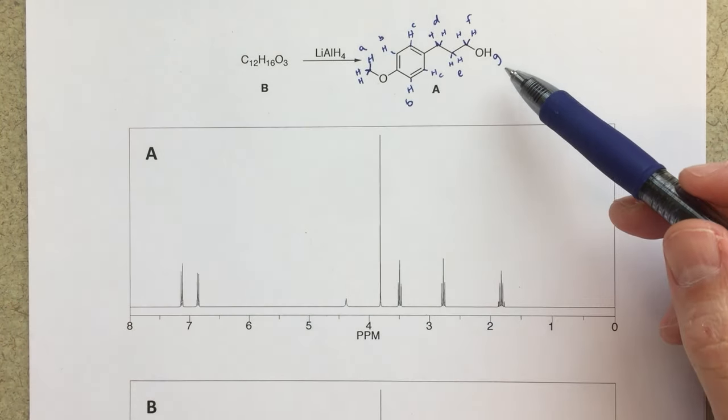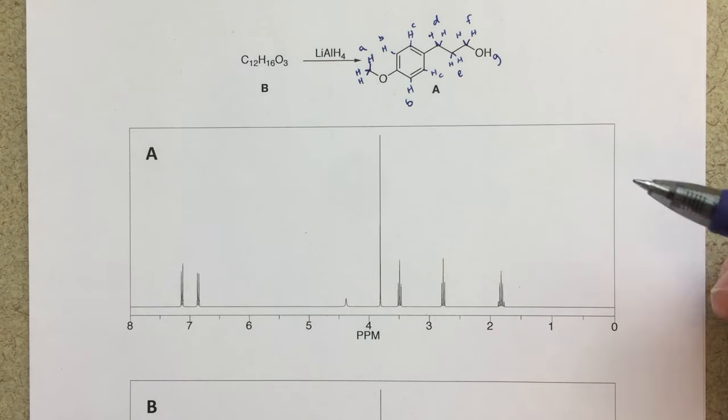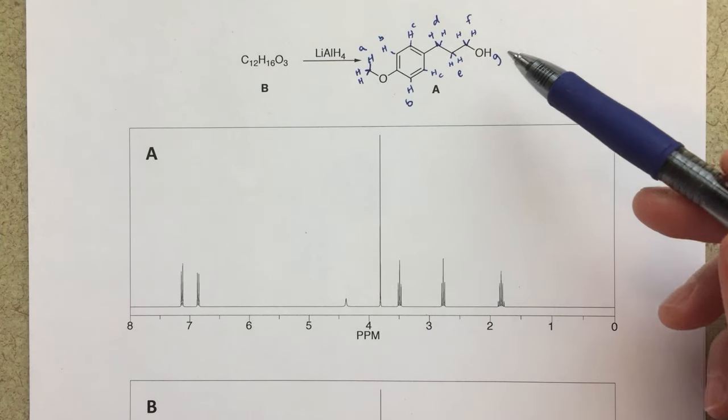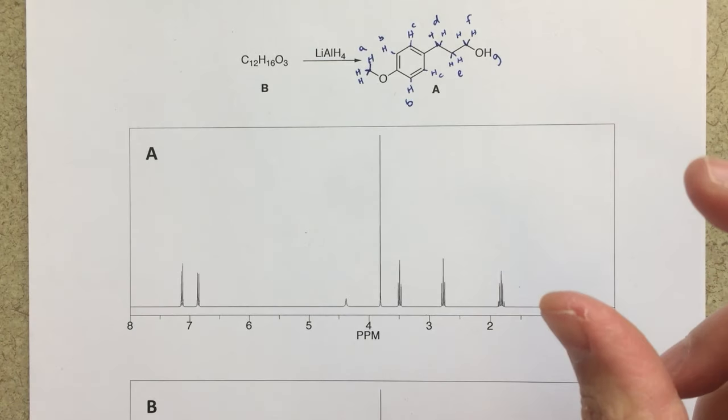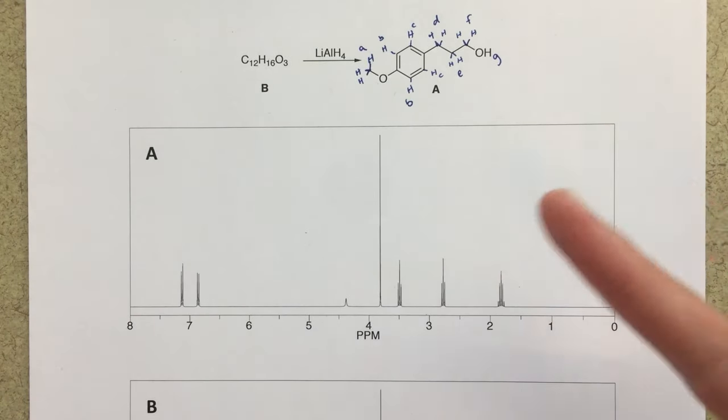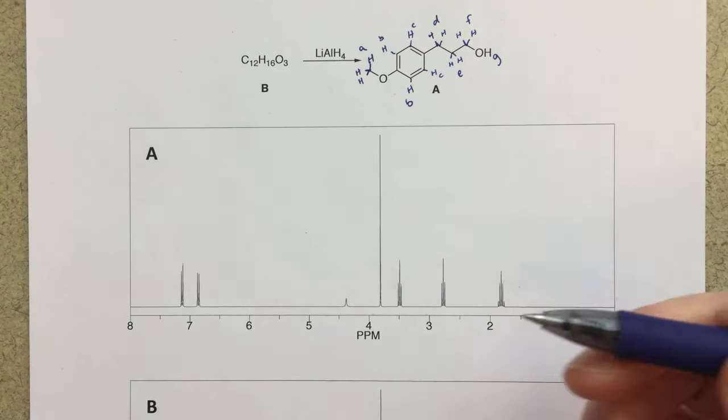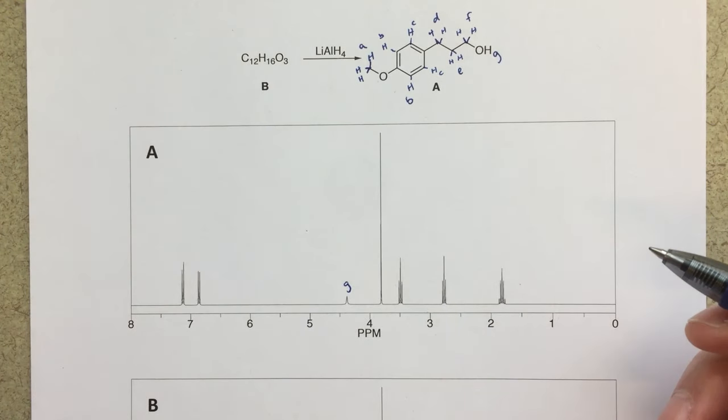Now this OH proton, you may or may not see a peak for that, depending on what solvent you're in, and in this solvent, whatever this NMR was generated from, we do see that peak, that's going to be this little peak here. We would expect that to be broadened. Those OH peaks oftentimes, especially if there's some exchange happening, those are going to be little broad peaks, and that's what we see here. So I guess we'll go ahead and label that here. So that's going to be G, one H singlet.